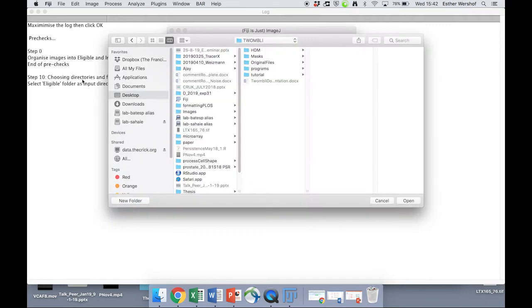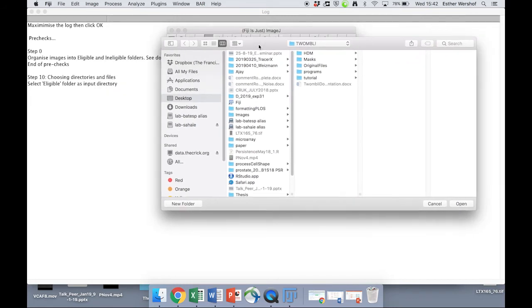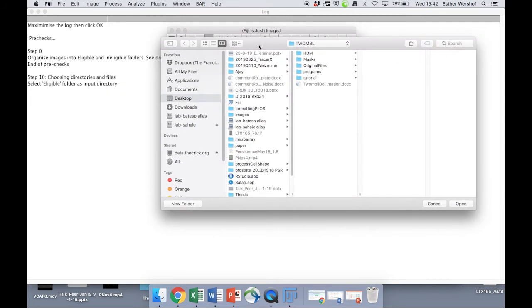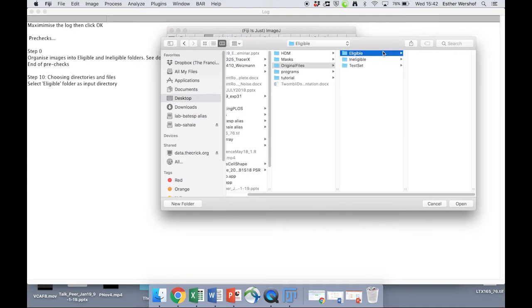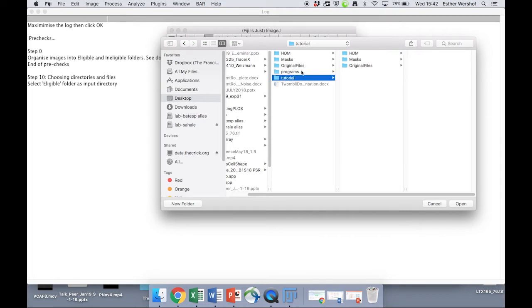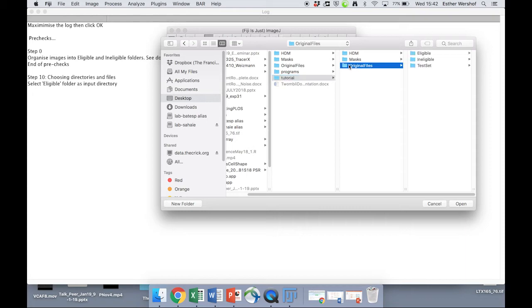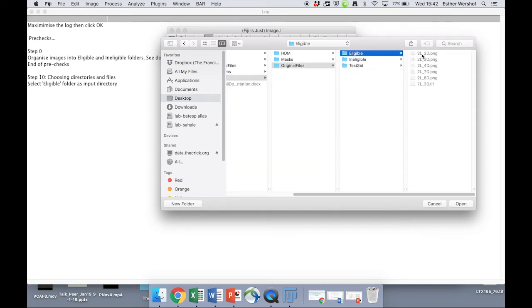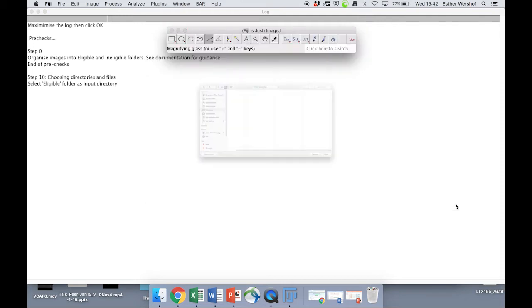So we're going to jump straight from step zero to step 10, which is where we're no longer looking at the test set files but all of our other files. So we're going to select all of our eligible files. Actually, that's a very important point. We are now inside the tutorial, so we need to look at original files inside the tutorial. We're going to click on our eligible directory.